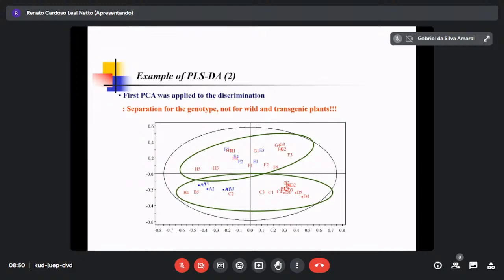It's simple. Of course, if you do it manually, you have to change everything. But now, in metabolomics analysis, there is a permutation test in any kind of vendor software. When you do PCA or actually PLS modeling, there is a function for the permutation test. Of course, there are other relationships and data sets, but the permutation test is the simplest.